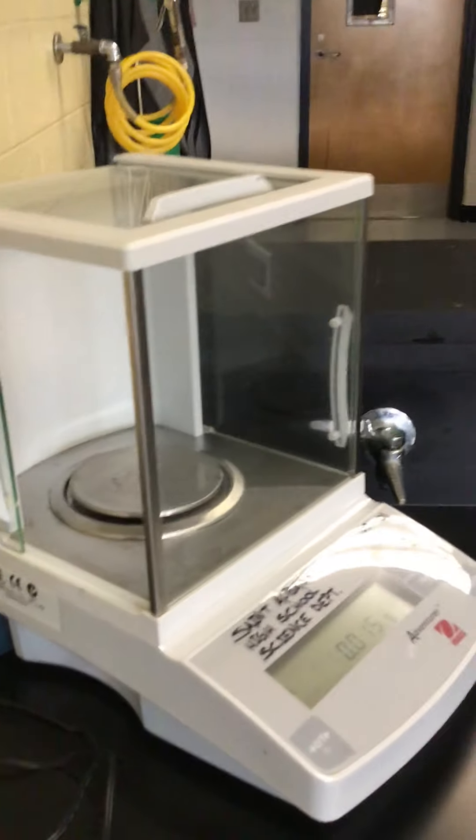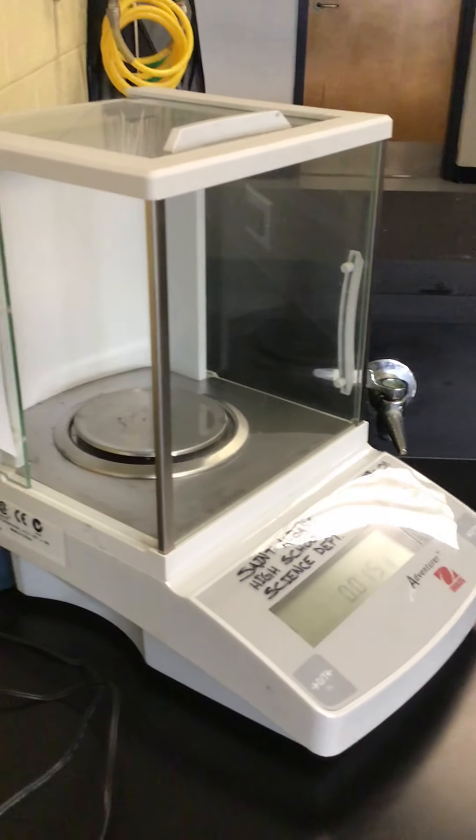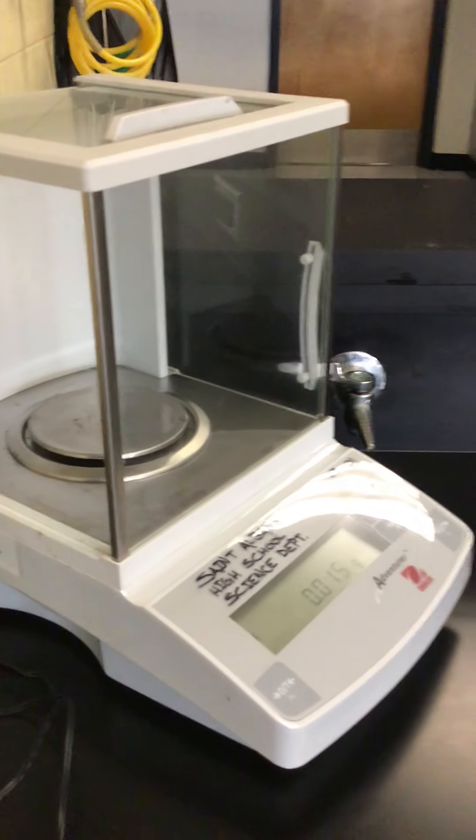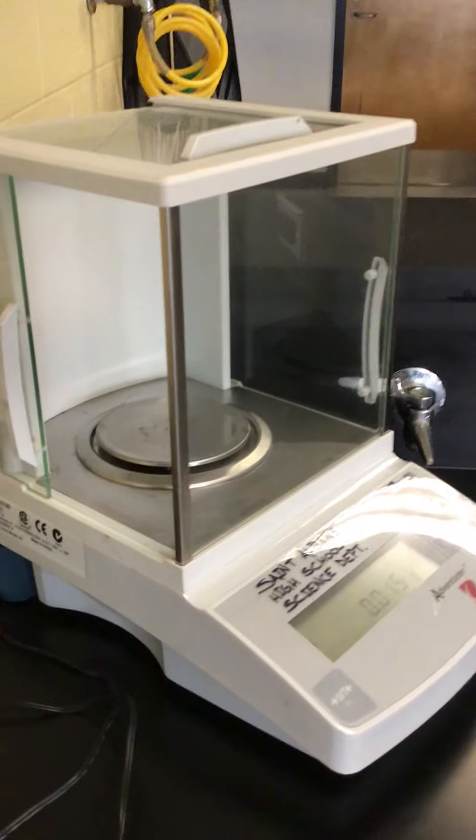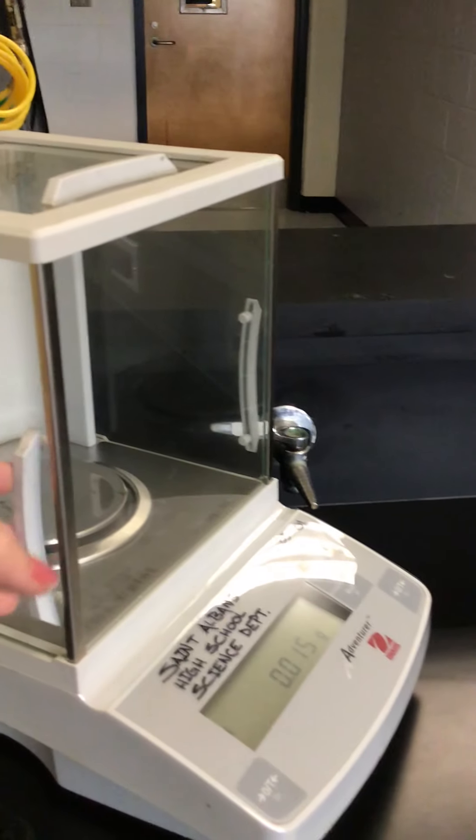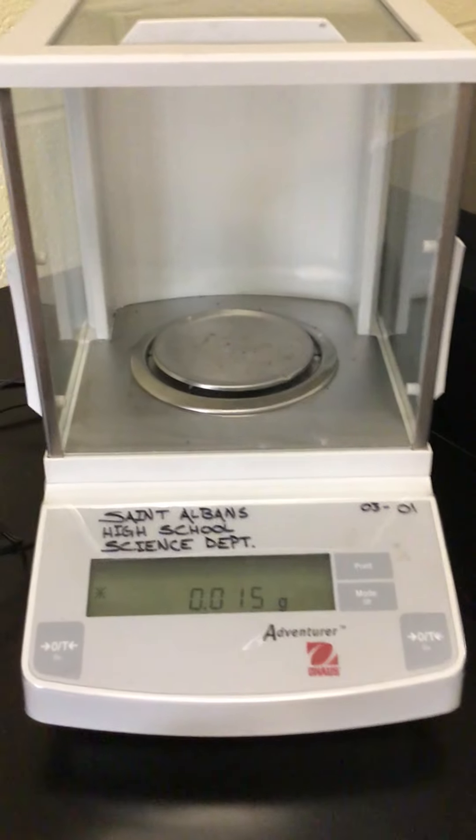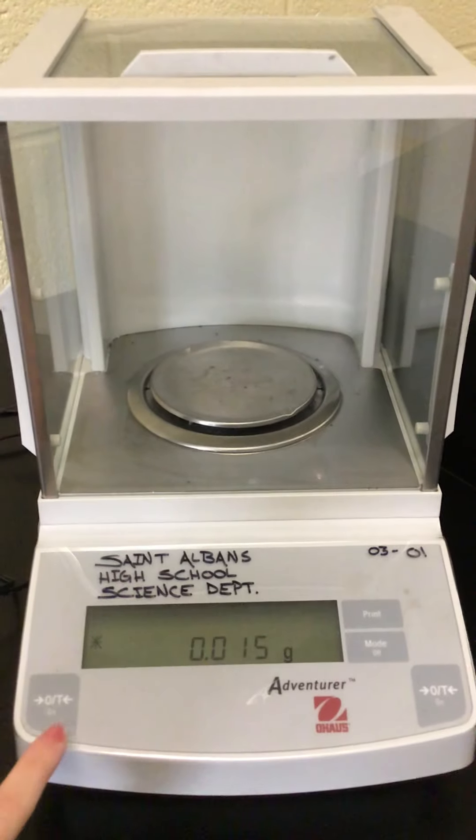Now if you zero your scale and try and take your measurement with any of these doors open it can affect the accuracy of the scale. So when you're zeroing it out and when you're actually measuring something you want to make sure all the doors are shut and then you just want to tare your scale.